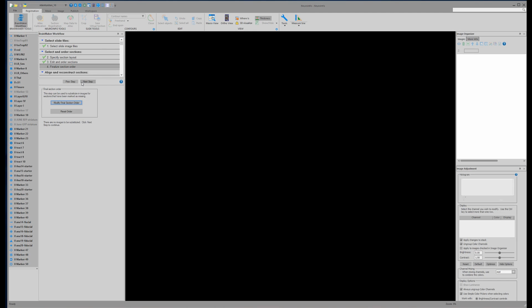And so, Chip, these were imaged at what magnification? What's the resolution of these sections? These are all sections that were imaged at 10x using a 10x objective. Almost all of the things that we do from this brain were imaged with a 10x objective, which is typically pretty good. And so that's sufficient for cell detection as well as the connectivity analysis you were showing us. Yeah, exactly.